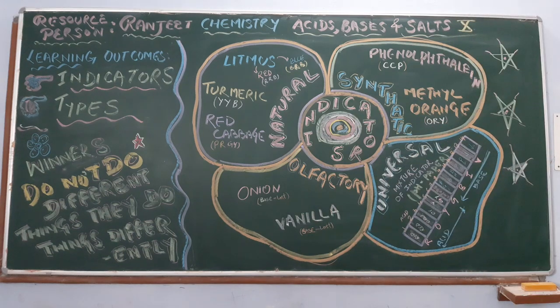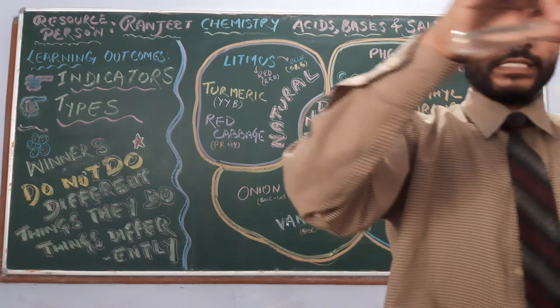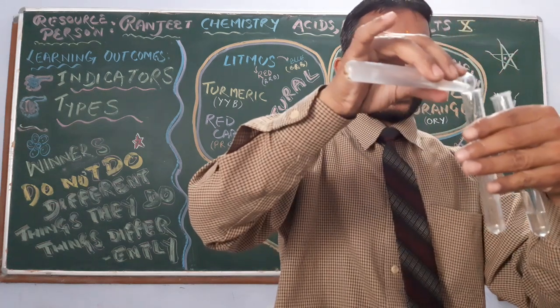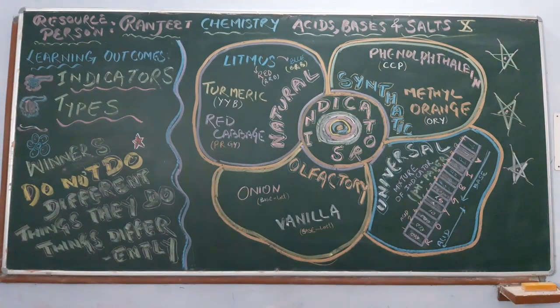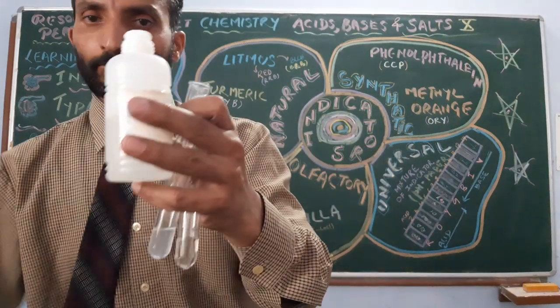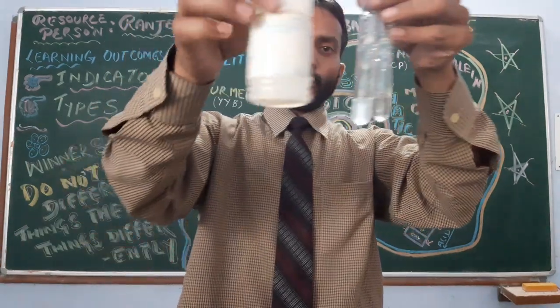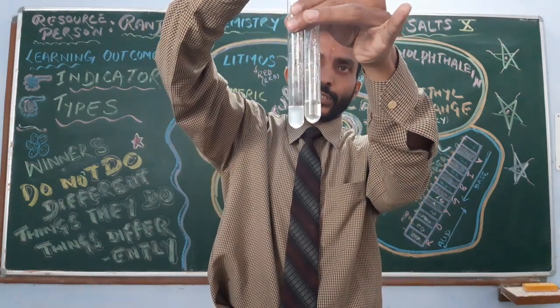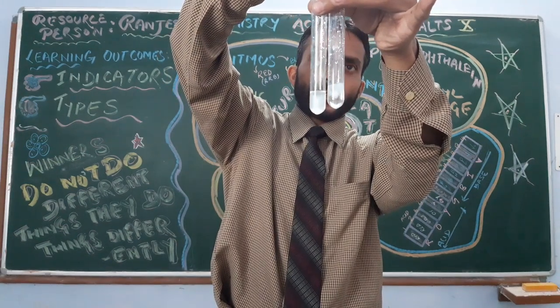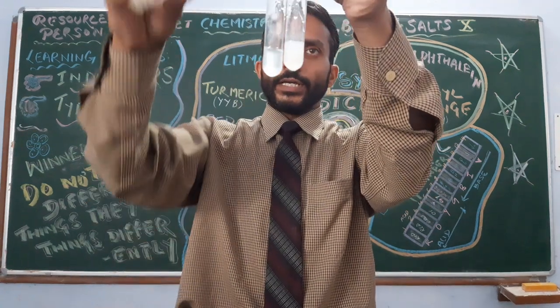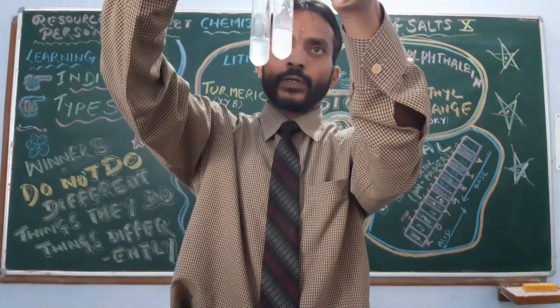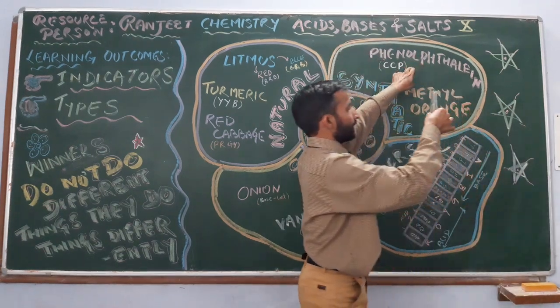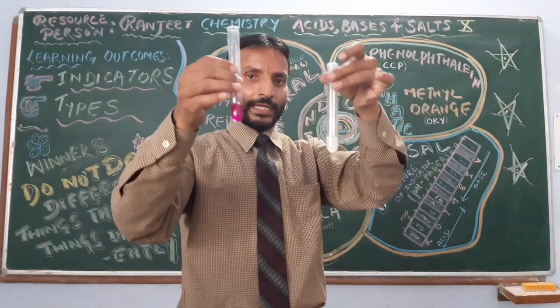Let us see practically. I am having acid in one test tube, and I will use base in another. Now, phenolphthalein — I am having phenolphthalein here; it is also colourless. When I add some drops in acid it remains colourless, there is no change. But when I add it in base it becomes pink. So phenolphthalein: in acid — colourless; in base — pink.